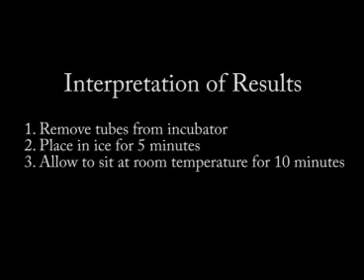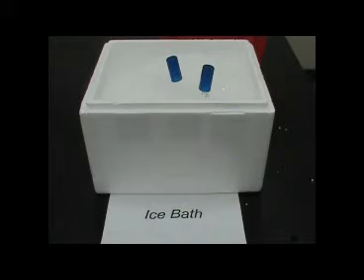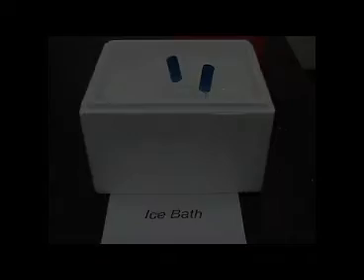Interpretation of results. There are a few steps you will need to take after incubation of the tubes. First, after removing the tubes from the incubator, place them on ice for approximately 5 minutes. After 5 minutes, take them out of the ice bath, put them in a test tube rack, and allow them to sit at room temperature for about 10 minutes.